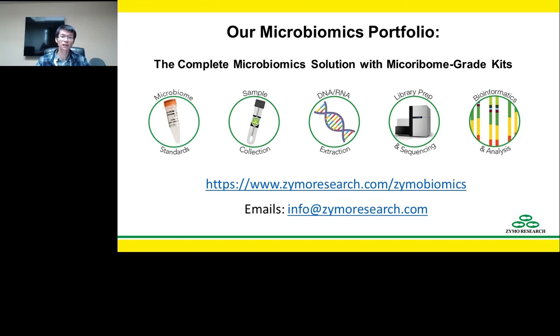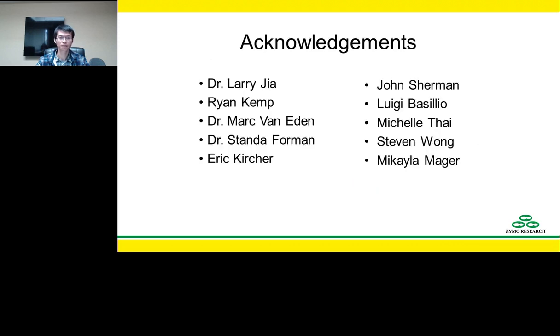In the end, I would like to highlight some of our efforts trying to improve the accuracy of microbiome measurements. All of these efforts, in the end, generated a complete portfolio for microbiome measurements.